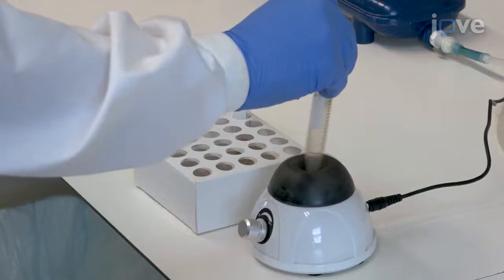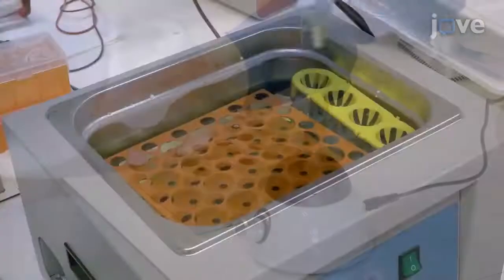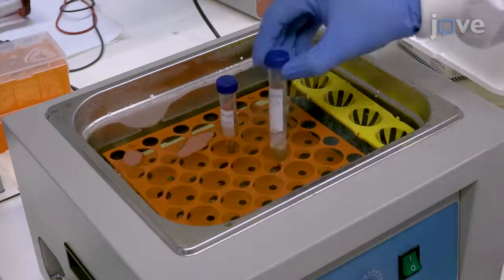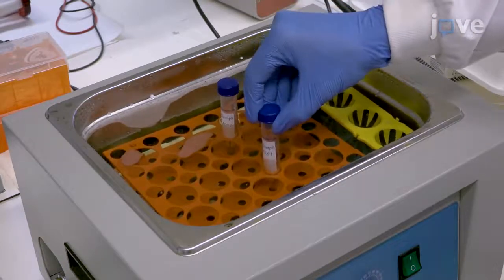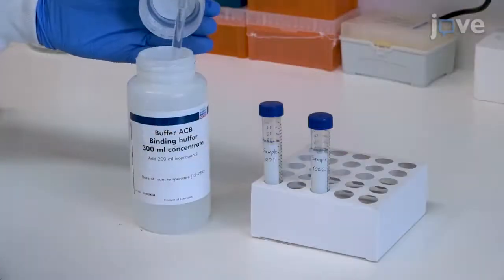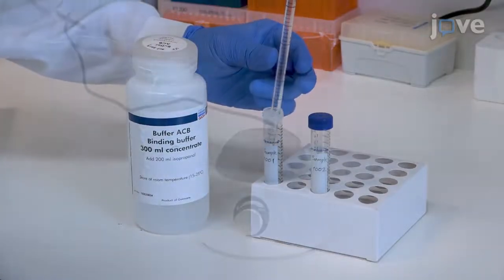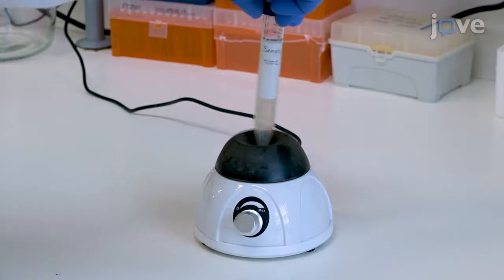Thoroughly pulse vortex the solution for 30 seconds before incubating for 30 minutes at 60 degrees Celsius. At the end of the incubation, add 1.8 milliliters of binding buffer to the tube and thoroughly mix with 15 to 30 seconds of pulse vortexing.